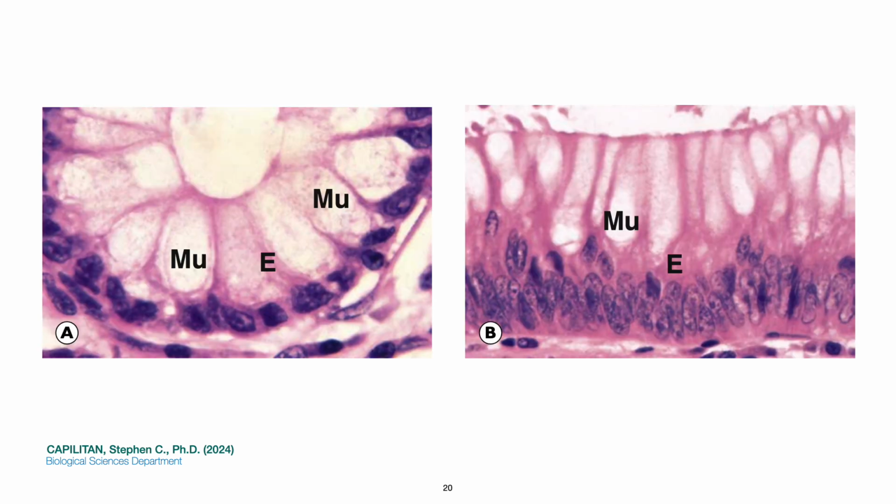These are the degrees of tumor differentiation in the colon. In letter A, it's normal mucosa in high power. Letter B is a benign neoplasm in high power. Note the similarity between normal colonic mucosa in letter A and a benign neoplasm, which is a tubular adenoma in letter B. In both cases, the epithelial cells are tall, in letter E, columnar and regular in form.